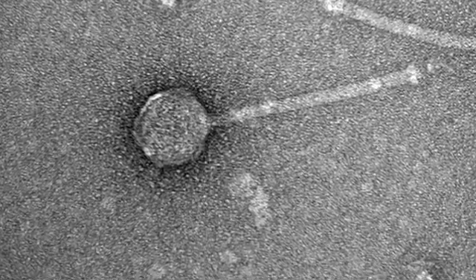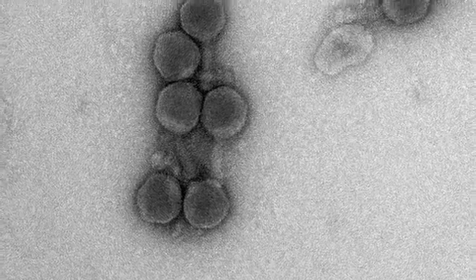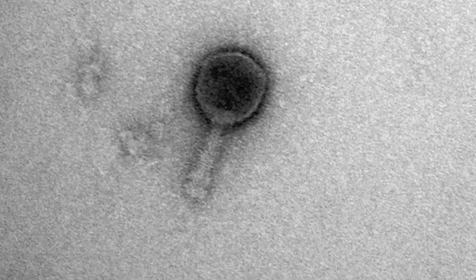In a week or two, the TEM facility will return digital images to us of your microbacteriophage. You'll see images such as the ones collected here from past semesters.